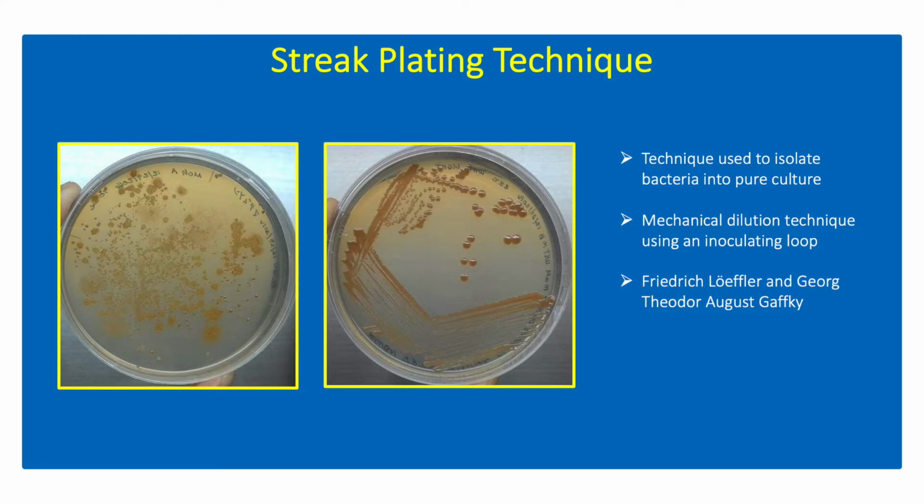Microbial populations rarely occur singly in nature. In order to study the characteristics and behavior of a microorganism, it should be first separated from contaminating species by purification or isolation techniques. In their natural form, bacterial cells occur in aggregates of chains or layers.